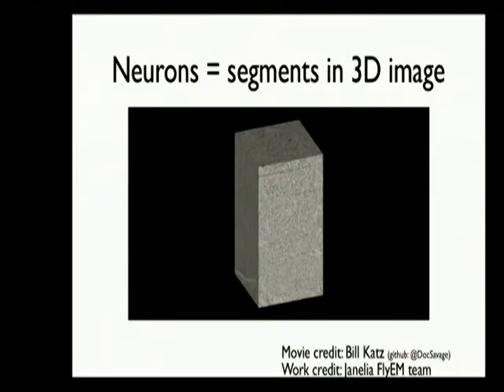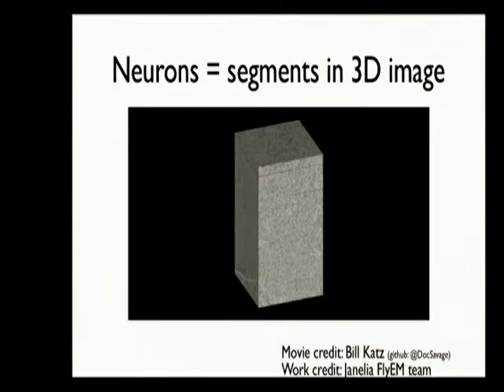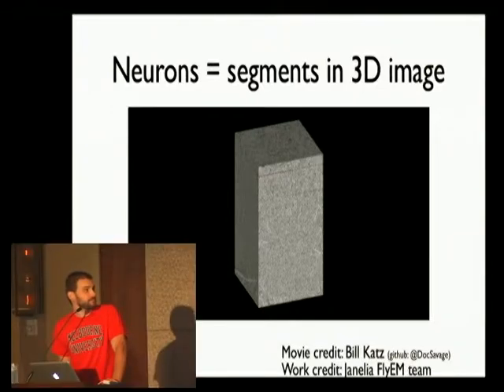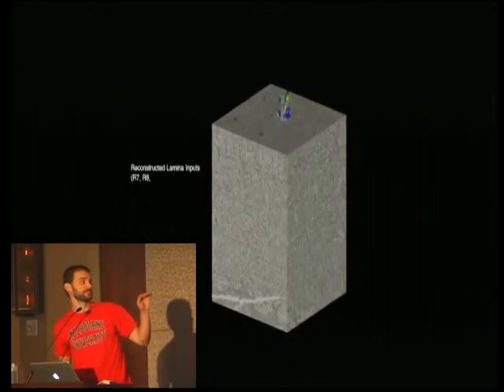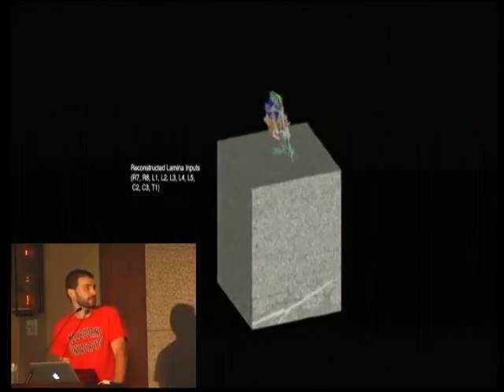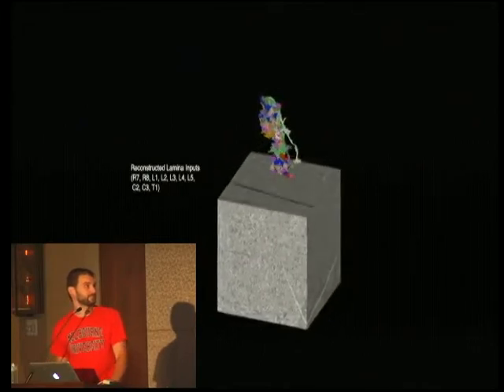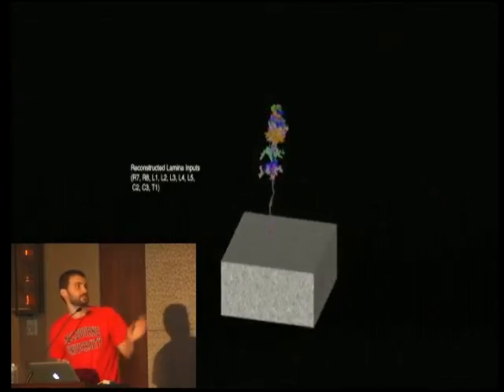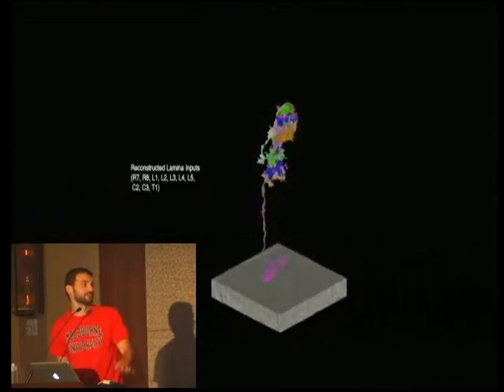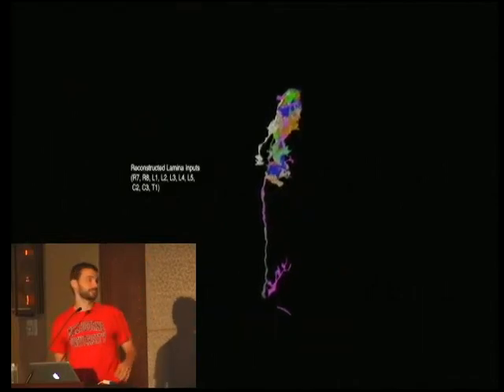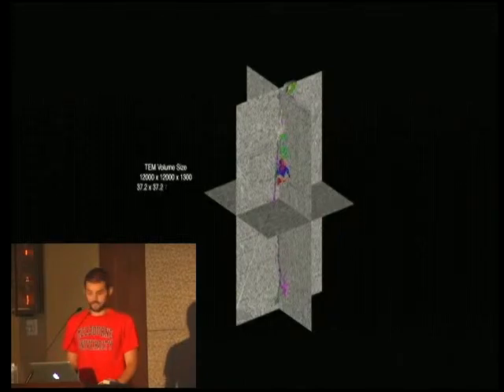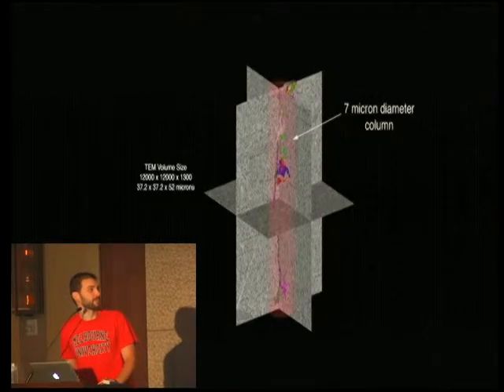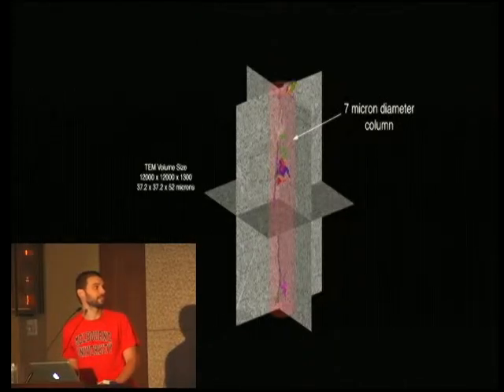In neuroscience, you can think of neurons as segments in a 3D image. What you're seeing here is a big volume of serial sections of electron microscopy, and within it are embedded neurons. You can see the segments within that image as neurons coming in from the previous part of the volume. This is part of the fly visual processing system — the lamina is the previous stage, and this is part of the medulla. That's about 190 gigs of raw data before any processing.